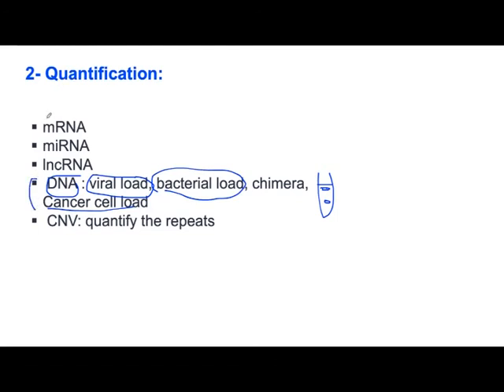You can also use messenger RNA expression, microRNA, or transcripts like this. If you want, I can actually have a very separate talk about microRNA. Or you have what is called long noncoding RNA. But again, you need to convert them to DNA with the reverse transcriptase.